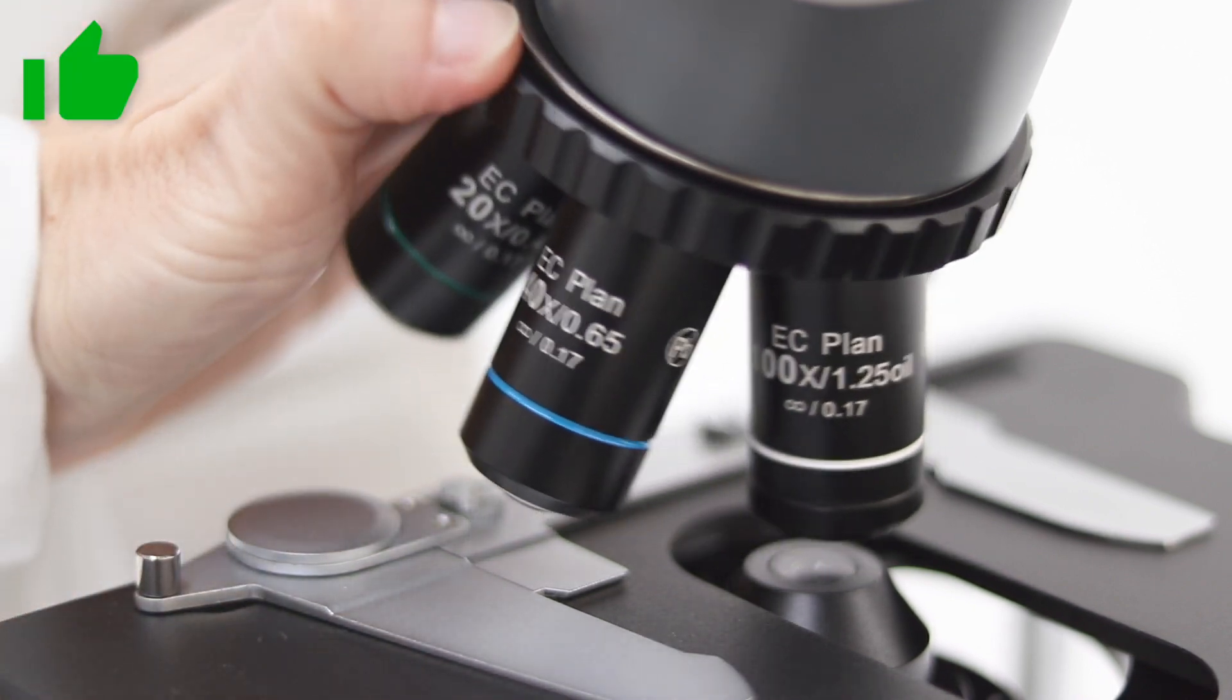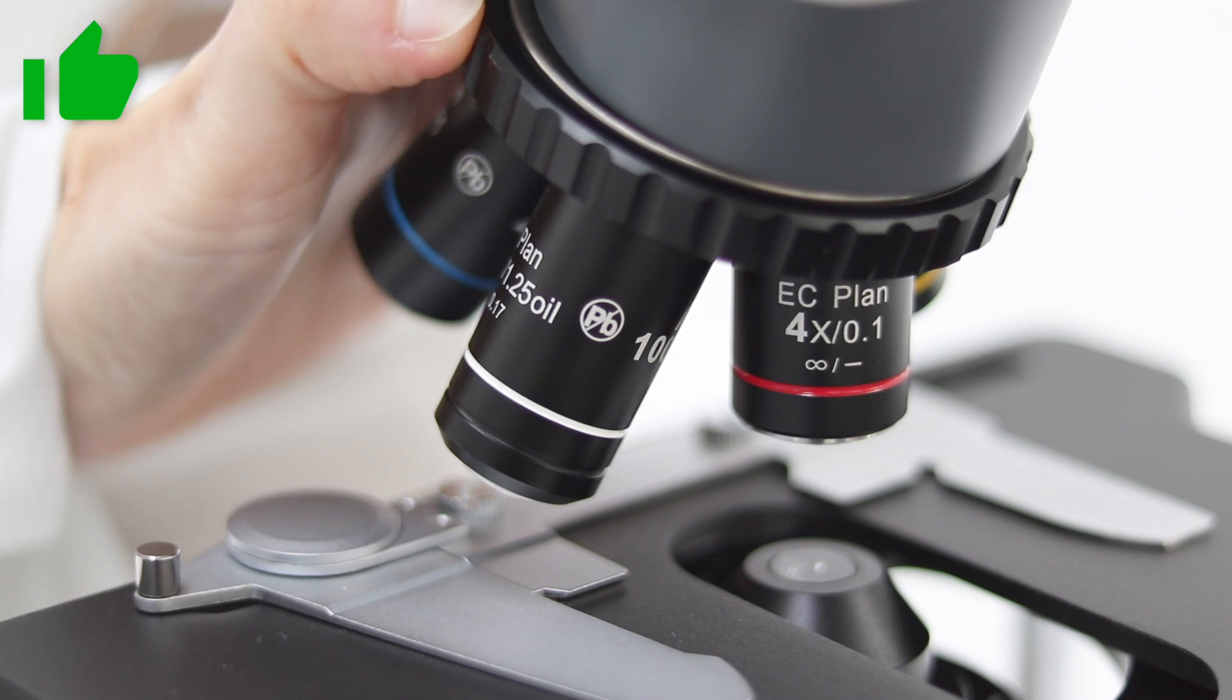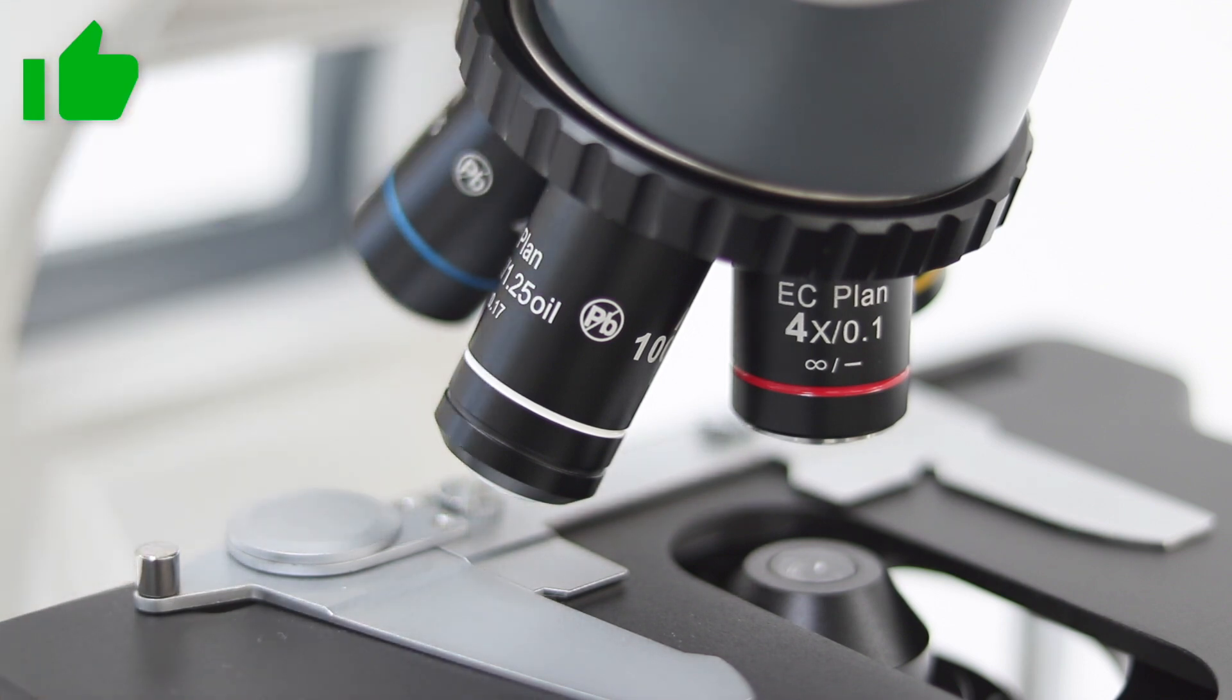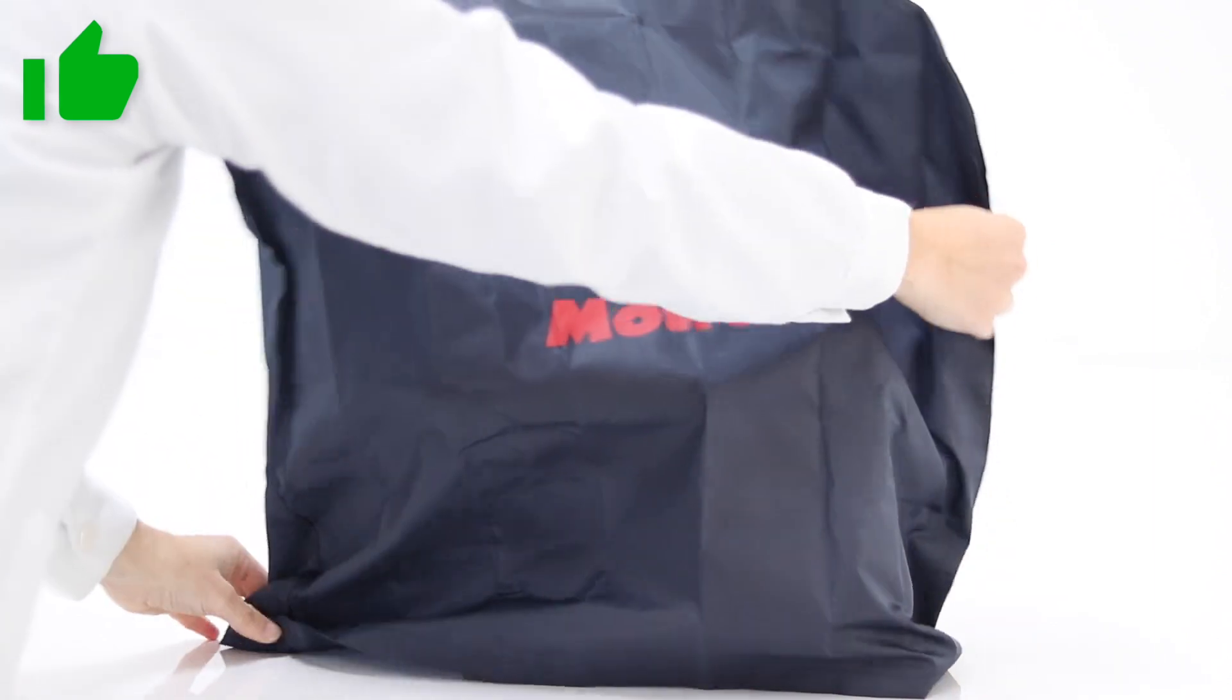Place the objective with the lower magnification, which can be easily identified as it is the shorter one, on the optical path. This will avoid any contact with the stage, condenser or slide when using it again. Cover the instrument with a vinyl dust cover.